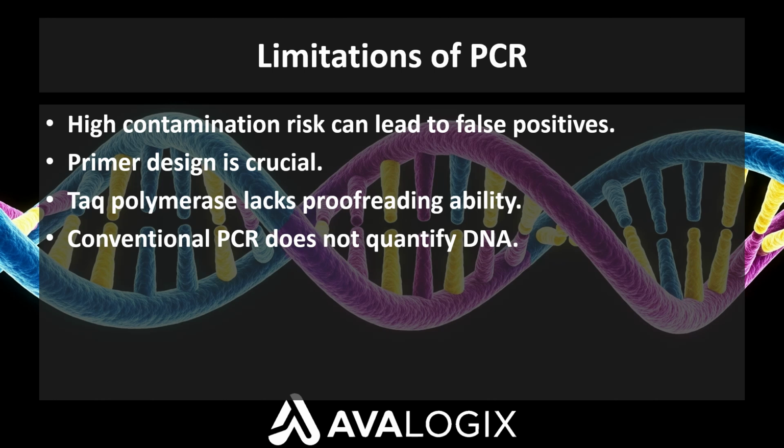Quantitative limitation. Conventional PCR, regular PCR, is endpoint analysis. It doesn't tell you how much DNA was there originally. That's where real-time PCR shines, providing quantitative data.